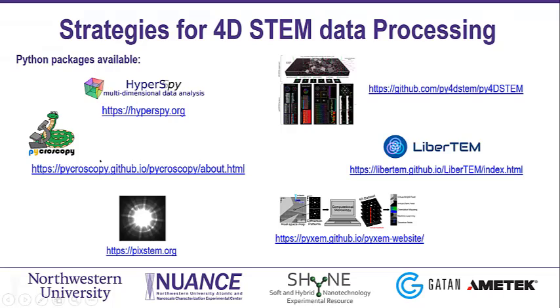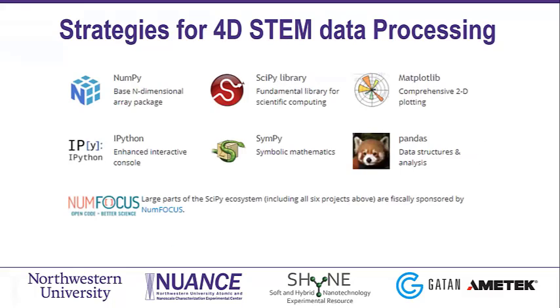But one thing I want to highlight, especially for Stephanie's talk, is that if you want to write your own code to start analyzing this data, you need to dig deeper. You could go ahead and use those packages that are ready to go. You might have to modify them, and since they are open source, you can do so. But if you are afraid to start, if you think that's too hard, the best way to start is from scratch. So that's our plan for today.